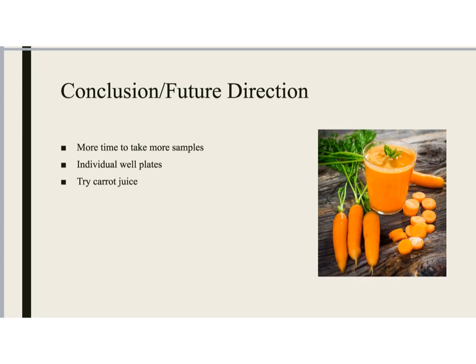In conclusion, I could determine this to probably be a decent source to induce apoptosis, but for right now I can't be sure. In the future I would like to take more time and more samples, whether this be 12 hours, 24 hours, 48 hours, 72 hours, and also over multiple days and multiple samples.